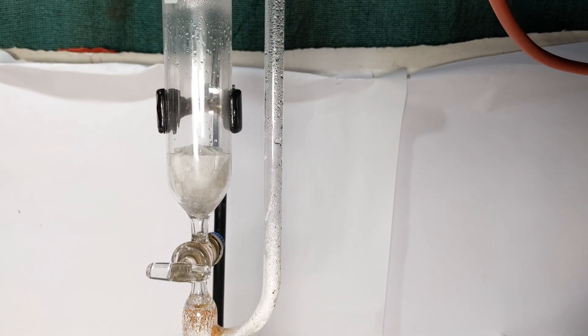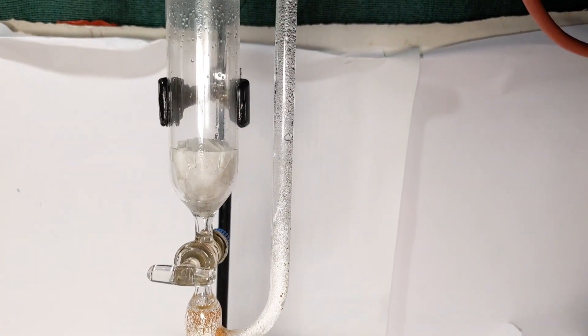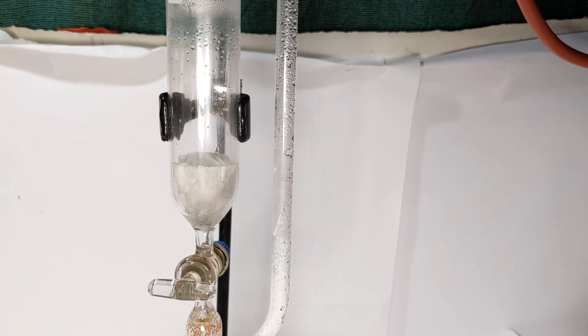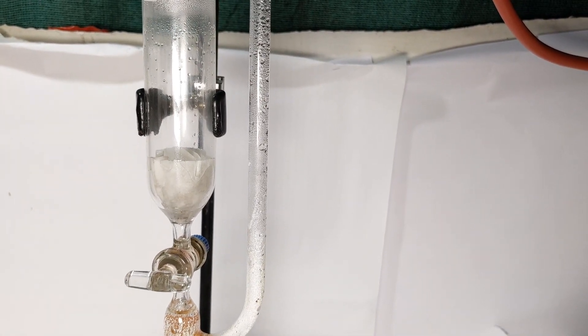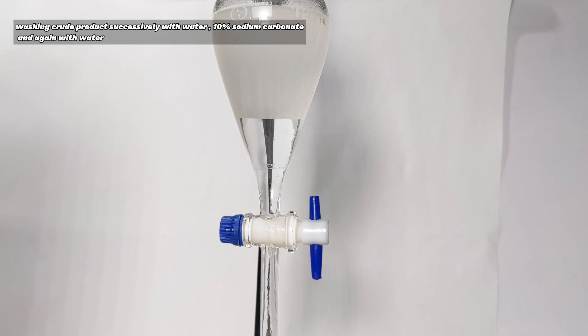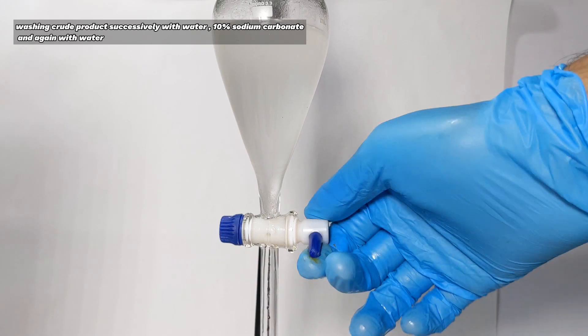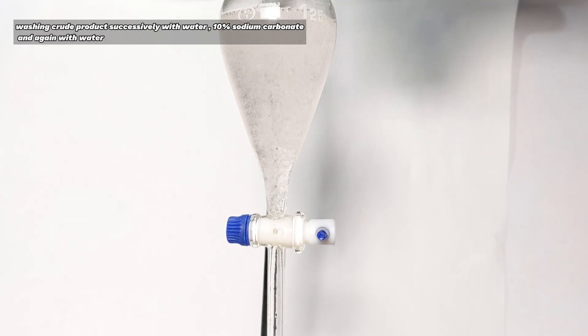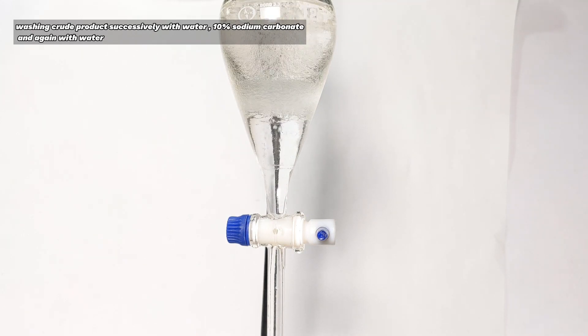When the reaction is complete, we have a clear solution and no traces of iodine was found. It was then transferred to a separatory funnel and first washed with water and then with 10% sodium carbonate solution and then twice with distilled water and separated the crude product.